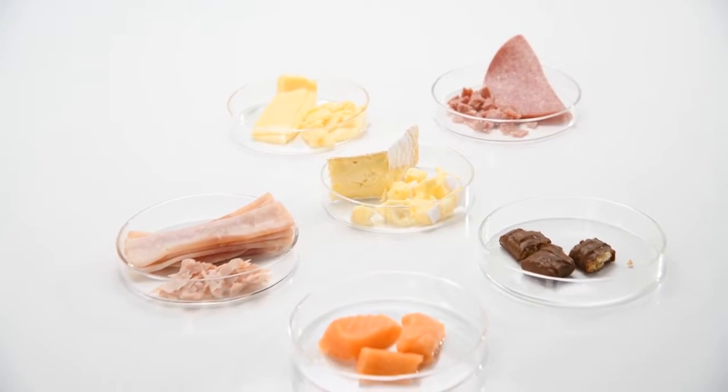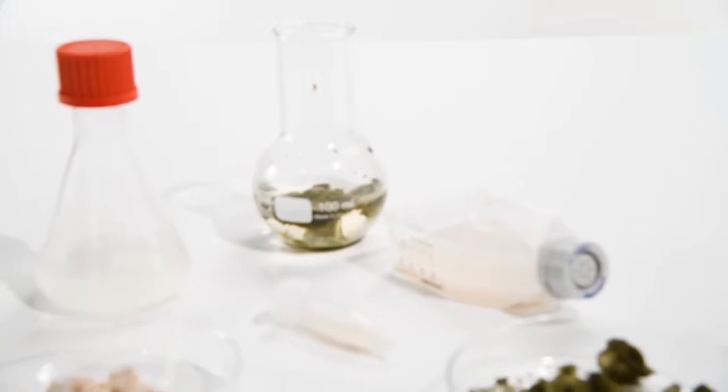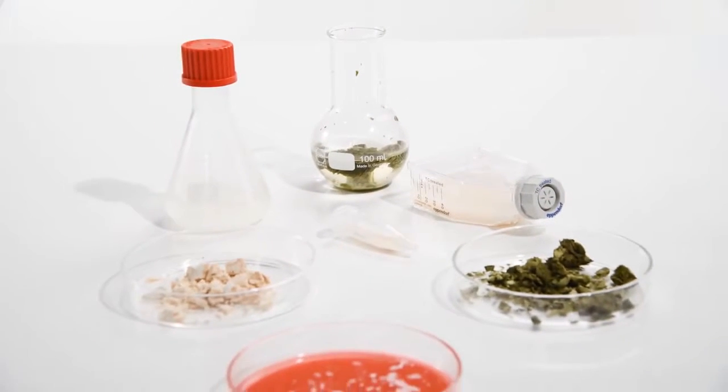Sonopulse ultrasonic systems are perfectly suited for homogenizing food products for content analysis. They also enable quick sample preparation in biotechnology laboratories.